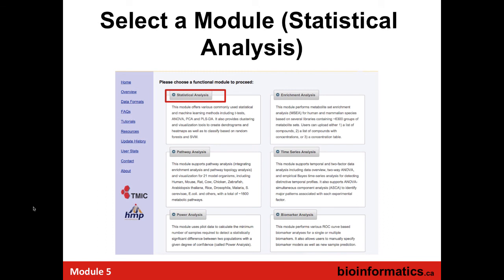Anyways, if you go in and click here to enter, this is the first screen you're going to see, and it's actually going to be 8 panels. I can only show 6, but from here what you do is click on Statistical Analysis, in the top left corner, which should be the natural thing to do because you all read from top to bottom, from left to right.